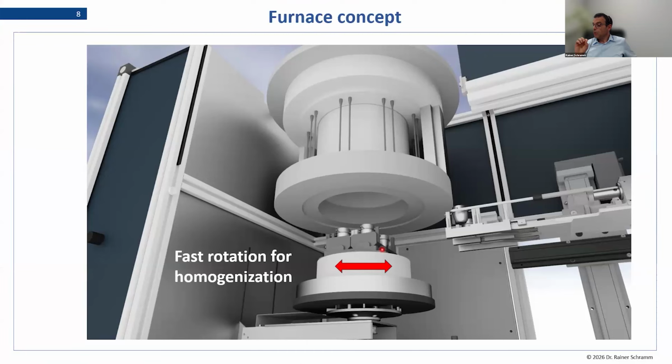I would say the most accurate technique is calcination because you exclude one parameter from the process. But this doesn't mean that you can't fuse non-calcined samples. It is just that then the LOI, the loss on ignition, is happening during your fusion process, and you have one parameter more, which can create an error. So that means the more precise method is with calcination.